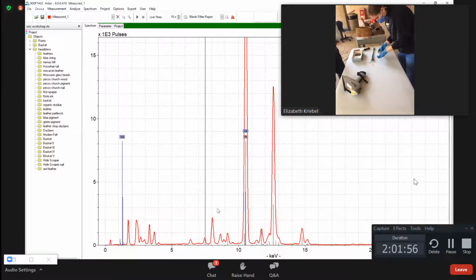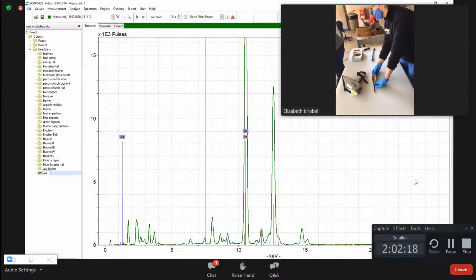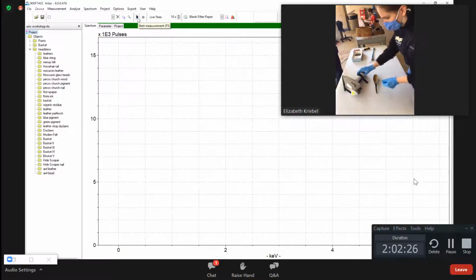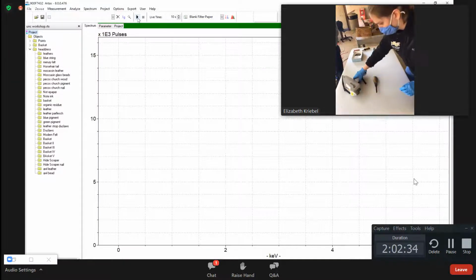And is this a spoon or something? A ladle? It looks like horn. I agree. Oh yeah, I guess. Yeah, it's horn. I don't know the function of it. And there are a couple of numbers on here. 73.1.5. Okay. It's just like with bone. Yeah, looks like keratin. A ladle or a spoon. Okay. All right. Flip it over to get a flatter surface.